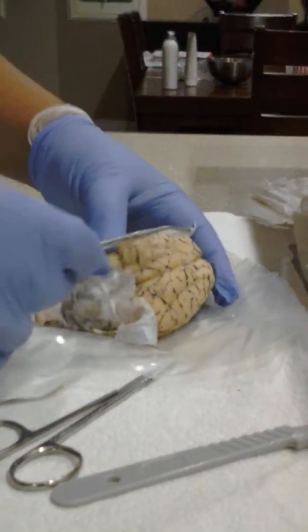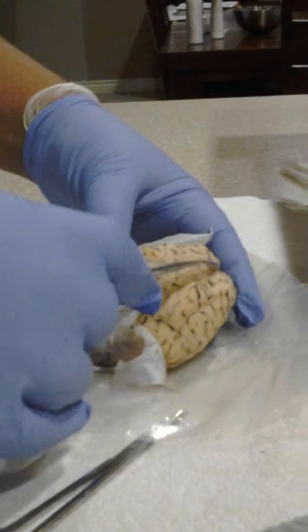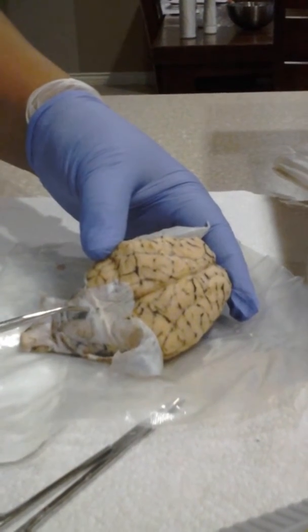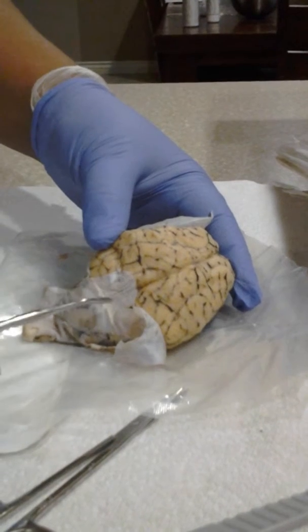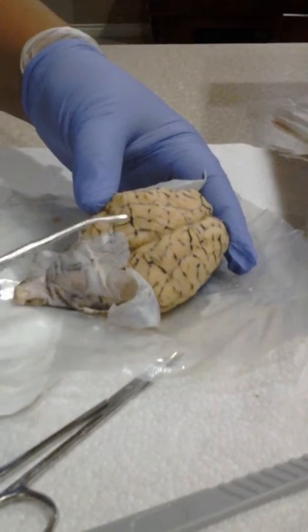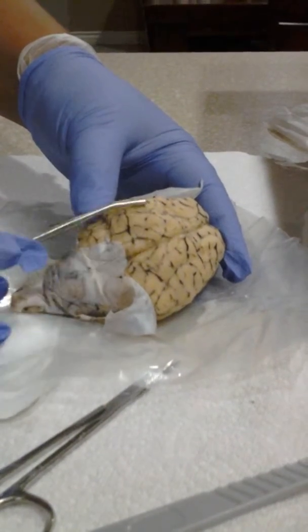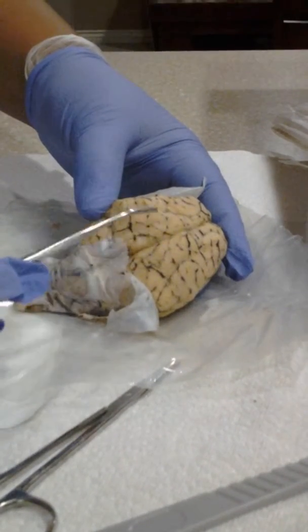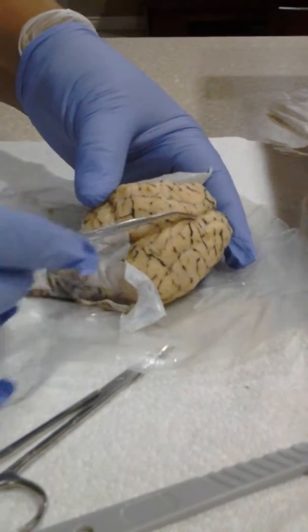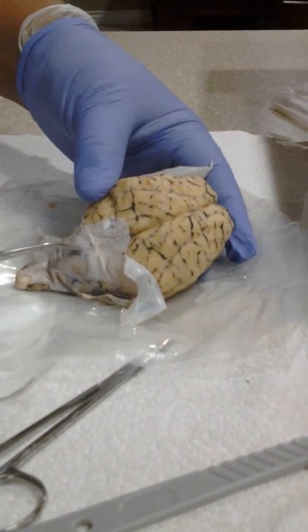Okay, here we have the longitudinal fissure, here down the middle. It is the deep groove that divides the cerebrum into right and left hemispheres, the right and the left. If you cut down the middle here of the longitudinal fissure, there would be two brains.